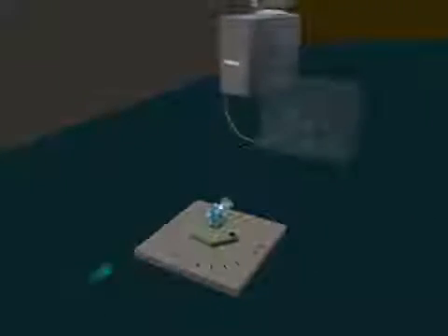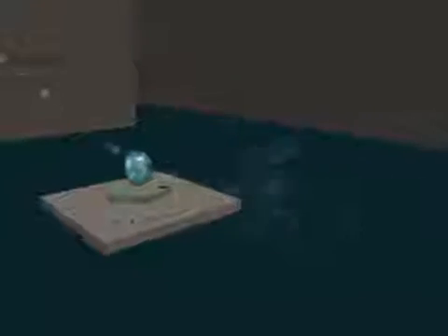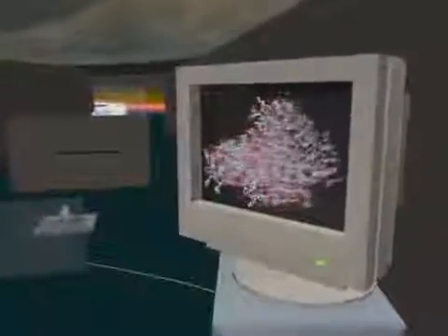This phenomenon is called diffraction. The diffracted X-rays form an image that can be seen by means of a detector. This image contains all the structural information of the sample. Using a particular software based on the principles of physics and mathematics, the researchers are then able to uncover the three-dimensional structure of the protein, atom by atom. One of the applications is the design of new drugs.